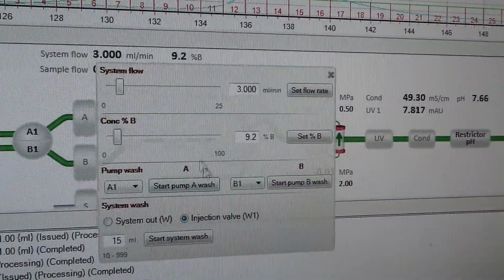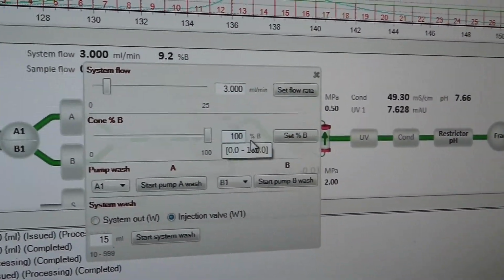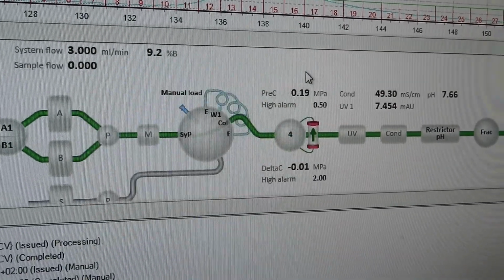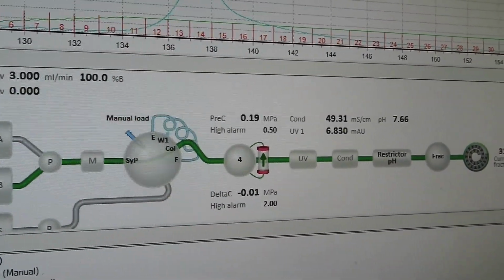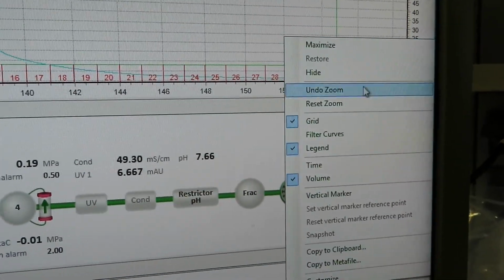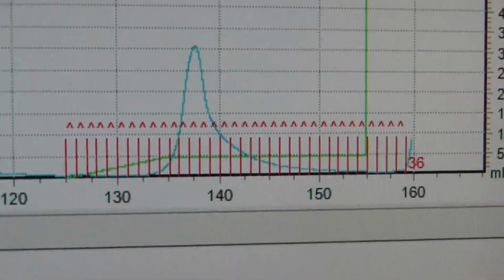Once the absorbance decreases because no more proteins are being eluted, the gradient can be continued to obtain more peaks. However, in this case, because of previous experience with this protein, we already knew that only one more population was going to be eluted. So then, in order to have a more concentrated sample, we decided to stop the gradient and elute the protein directly in 100% of the imidazole solution.